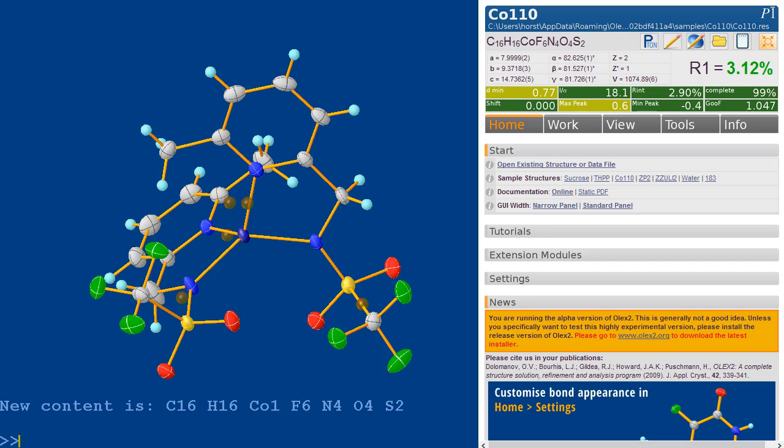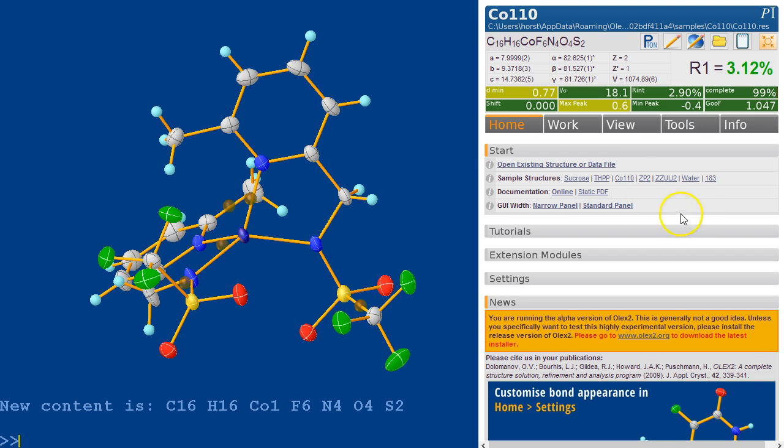Let's explore how Olex 2 interacts with ShellX. We've got a structure loaded, the structure CO110 that's supplied with Olex 2.